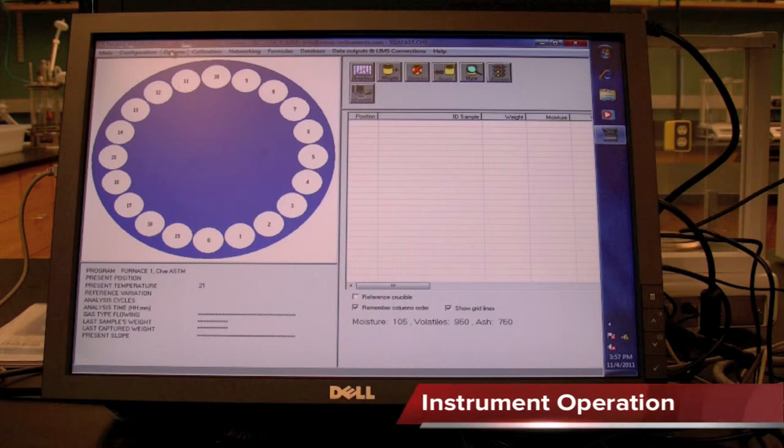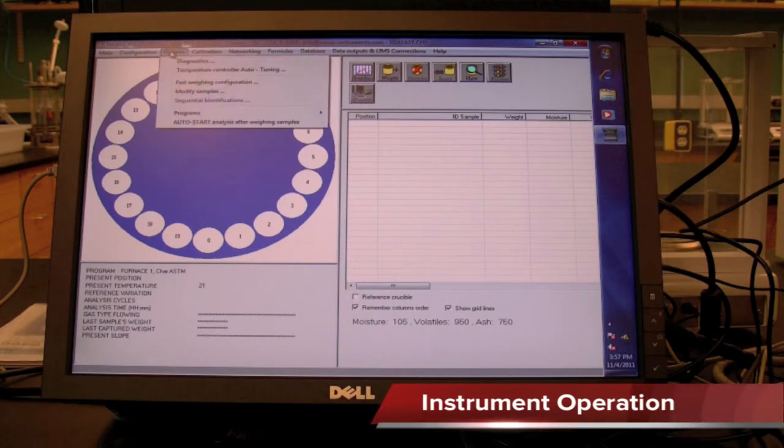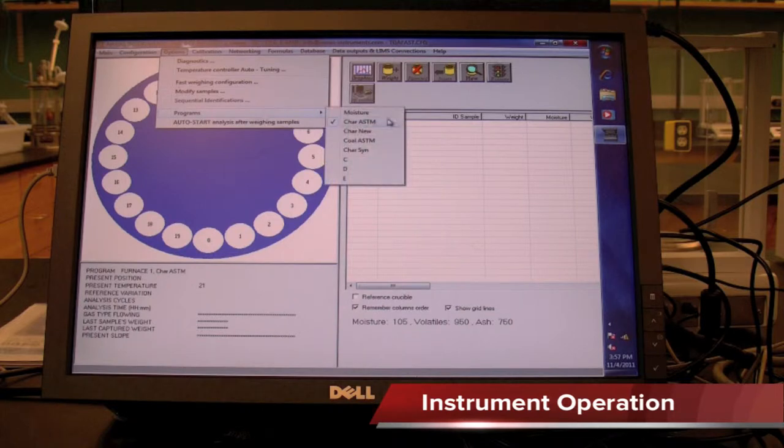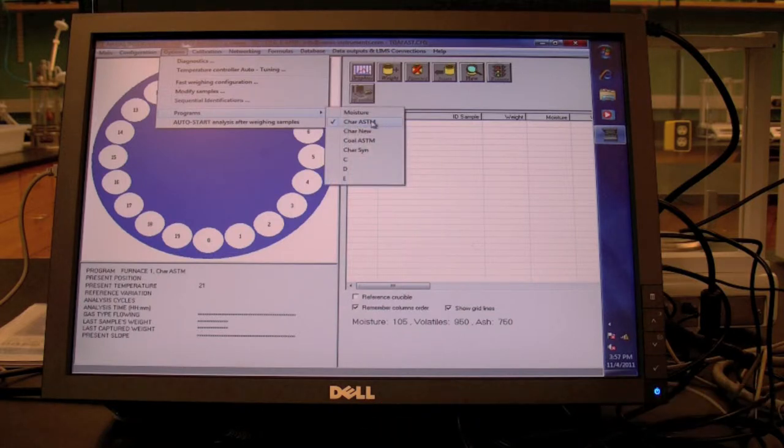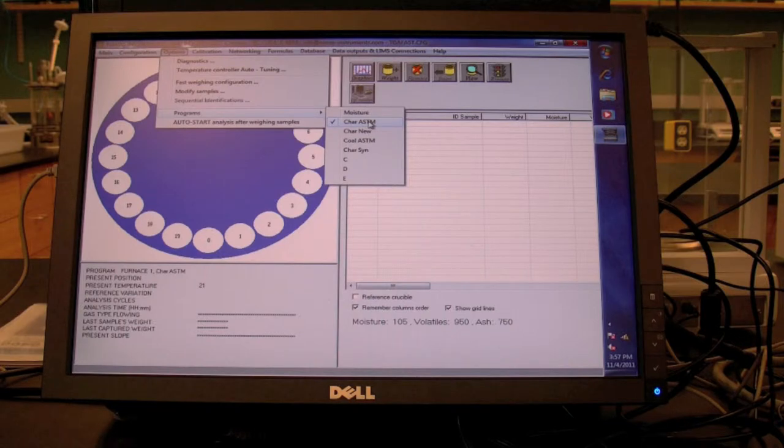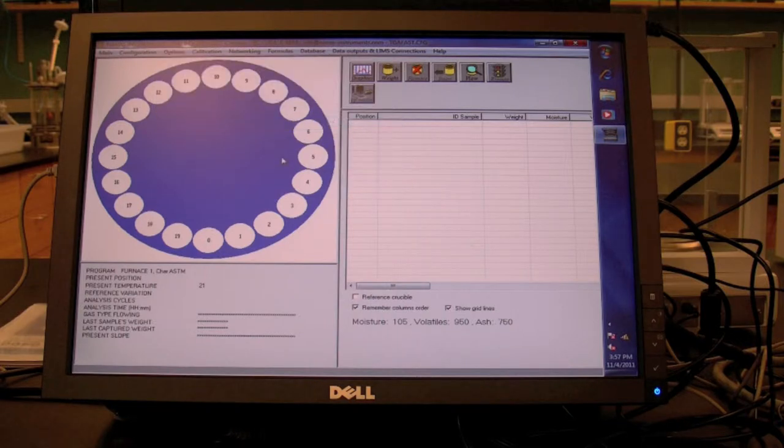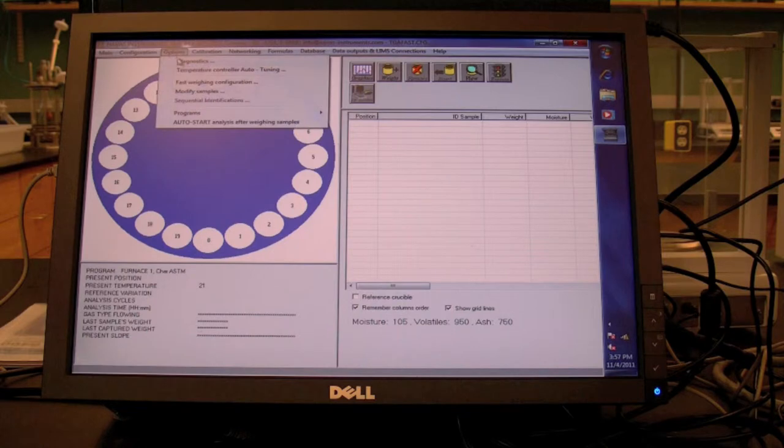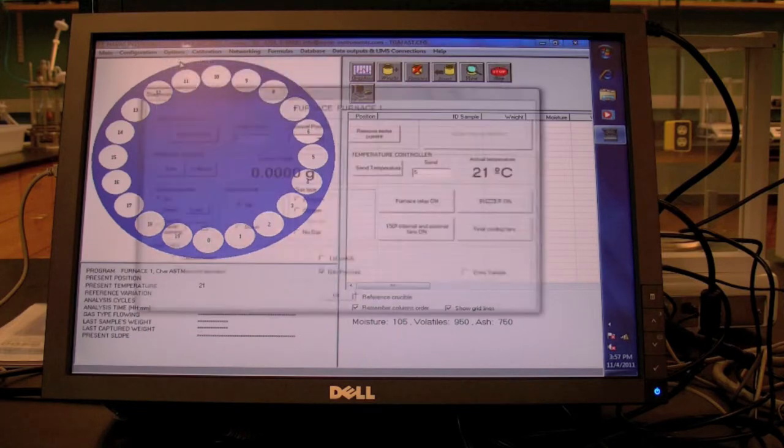Instrument operation. To begin, click the options tab and move down to the program toolbar. Choose the appropriate program for your application. Now, go to the options tab and move down to diagnostics.